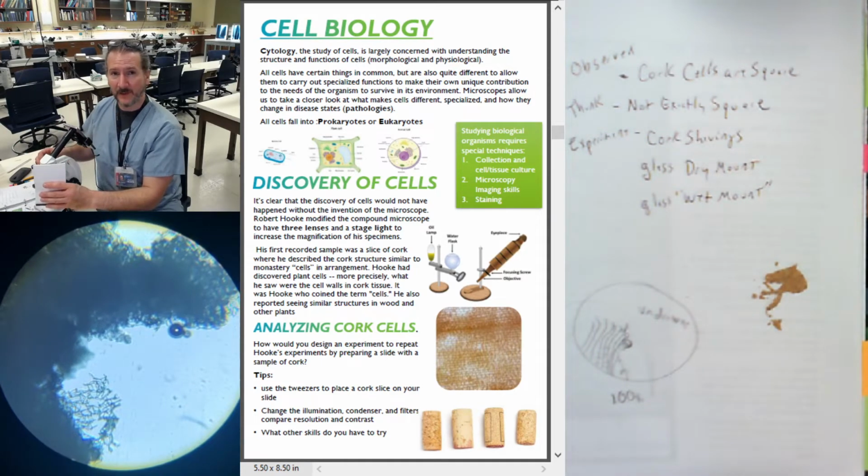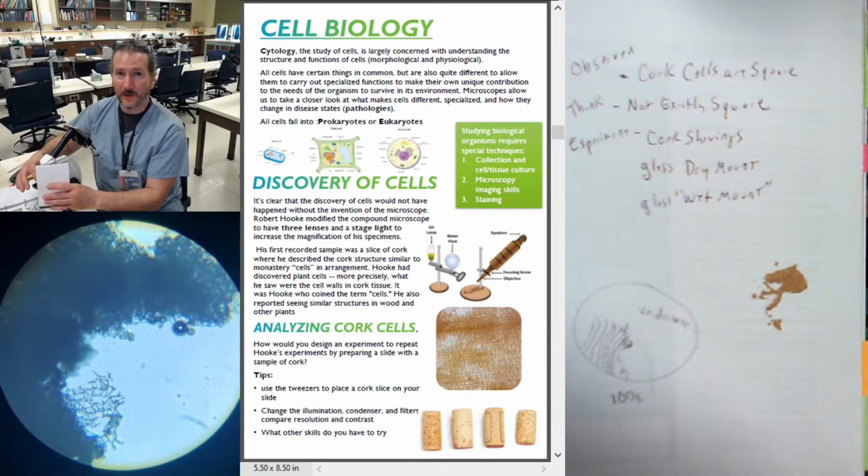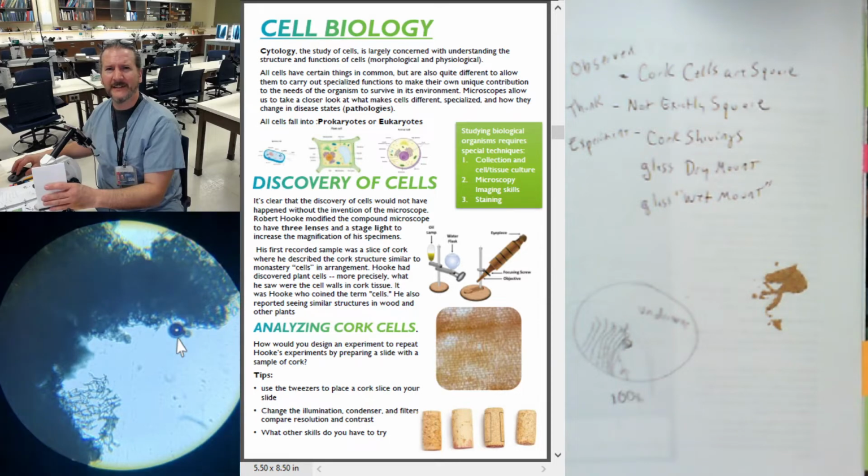So that bottom left, it's almost like a skeleton. I'm going to try and go one more up. See that black circle up here? That air bubble. I'm really more interested right here. I'm going to snap a picture just for funsies.